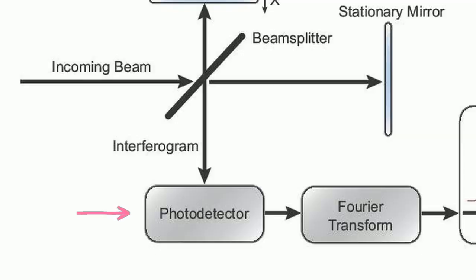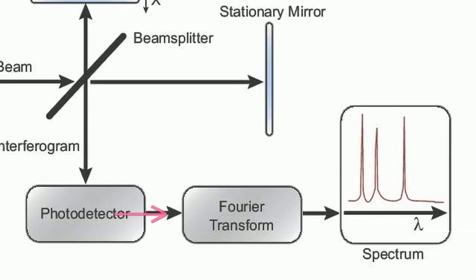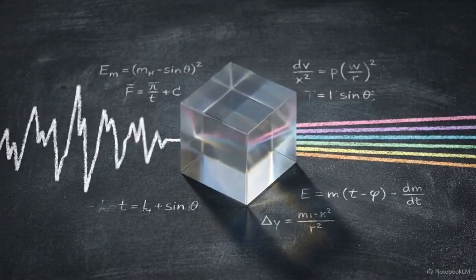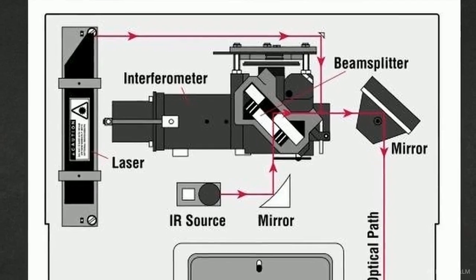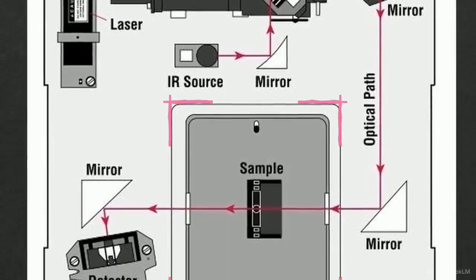Following the full logical pipeline, the detector records the physical interferogram, the software runs the Fourier transform, and the system outputs the final chemical spectrum. The Fourier transform acts as a mathematical prism, doing computationally what scientists used to do physically with glass. We can map these abstract concepts directly onto the internal chassis of a commercial FTIR spectrometer. The layout tracks the IR source, the interferometer block containing the beam splitter and mirrors, and the final sample compartment located just before the detector.